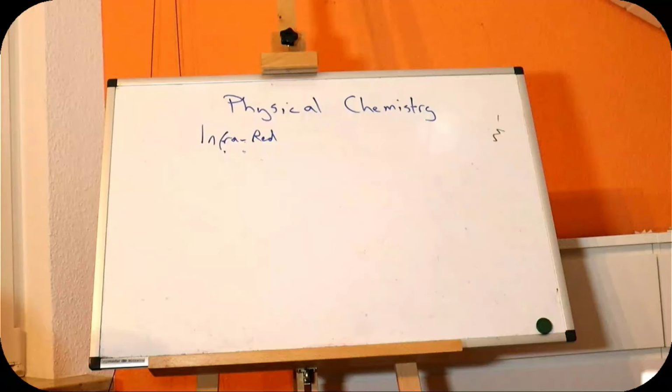lot more of them. So the practicality of the ATR, which is this reflection method, or the problems with making plates out of potassium bromide, for example, means that even if we want to measure the concentration of something in infrared, it's kind of difficult because it's hard to get a known amount of it into the beam. Having said that, it can be done, but it's not done very often because it's tricky and there are problems.